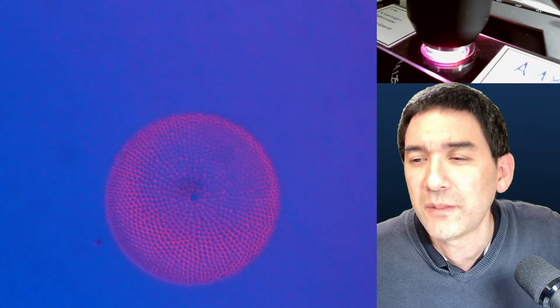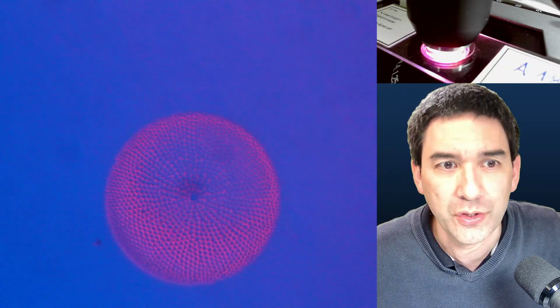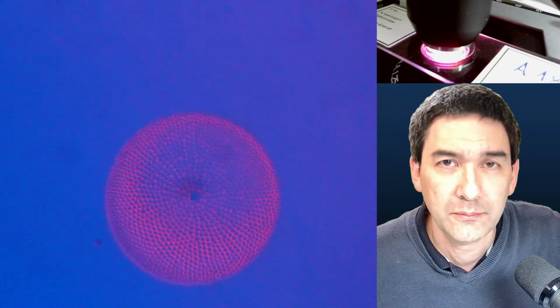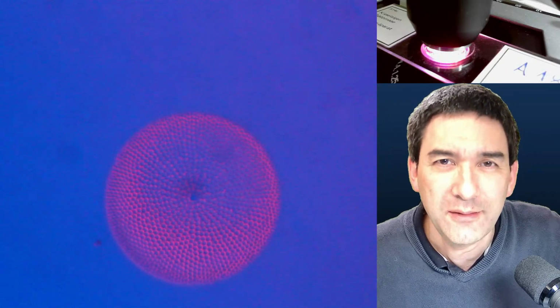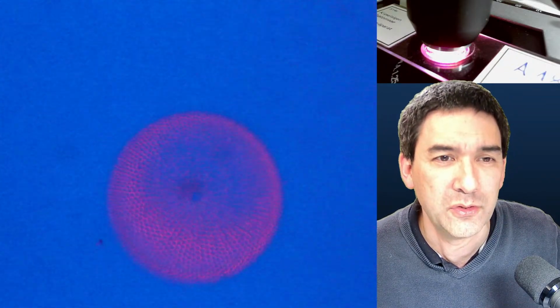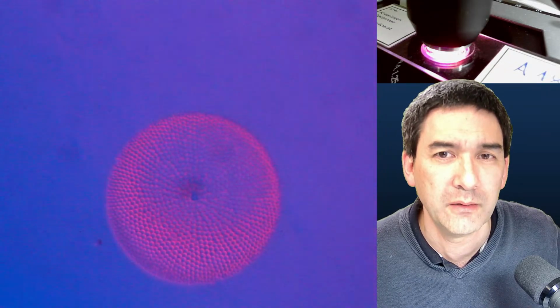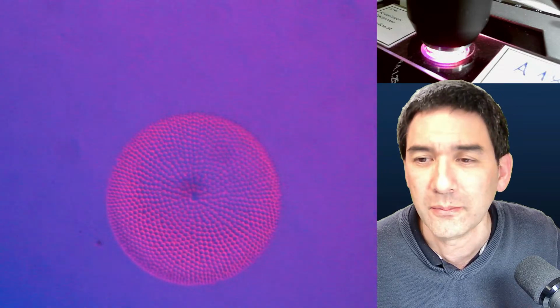How to choose the best diameter of this middle part? Yeah, that's what I just said, it is experimentation. I really would do that, because I did find out that the diameter can be quite sensitive, and sometimes, for example in my case, I even have to find the correct position by rotating the filter holder out and in a little bit.